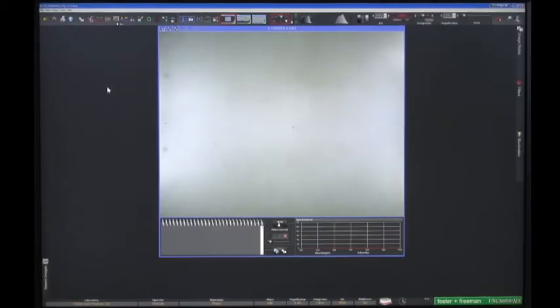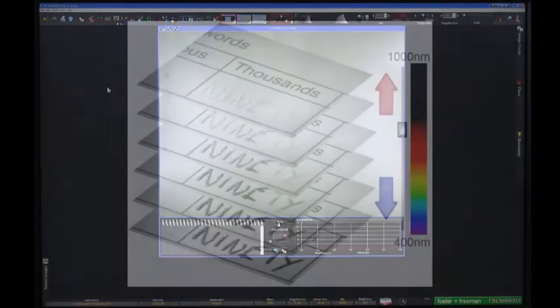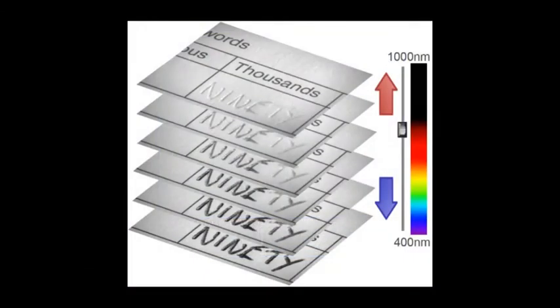The VSC software suite for the VSC 6000HS now includes a hyperspectral imaging facility which uses the bandpass filtered light source to create an image cube of a document. This cube can be thought of as being many images of a document, stacked one on top of another, each image being taken at a slightly different wavelength.